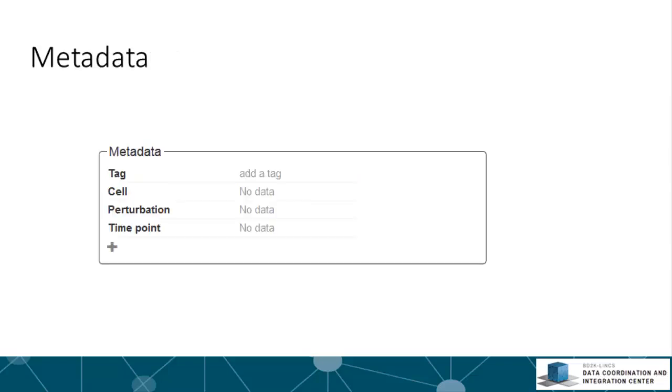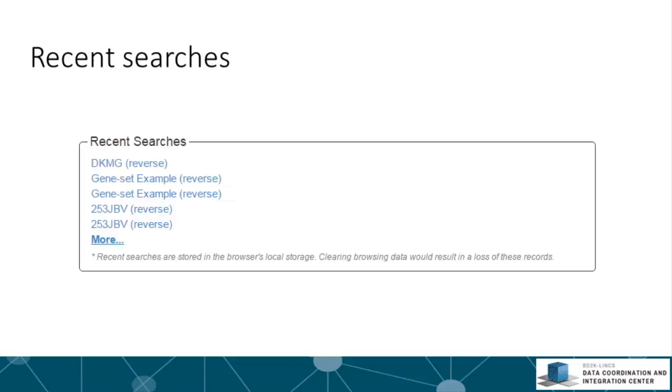In the metadata section, any metadata associated with the input signature can be entered. Clicking the plus sign will allow you to add more information. Most importantly, users are encouraged to type in at least one tag for future reference.